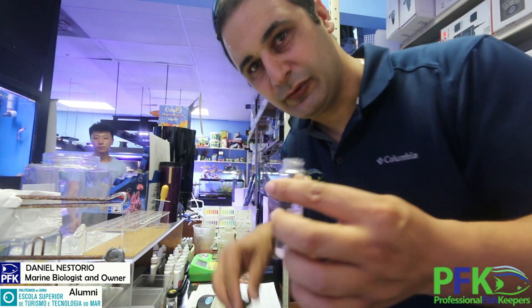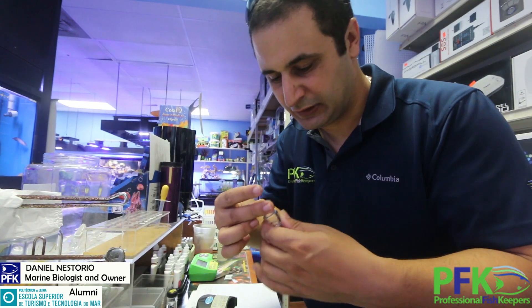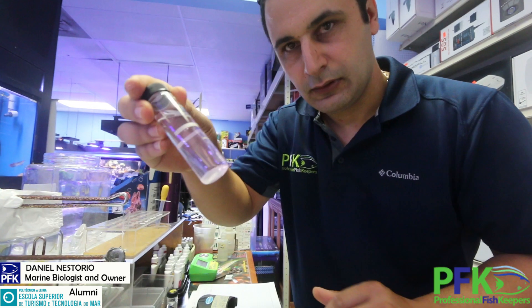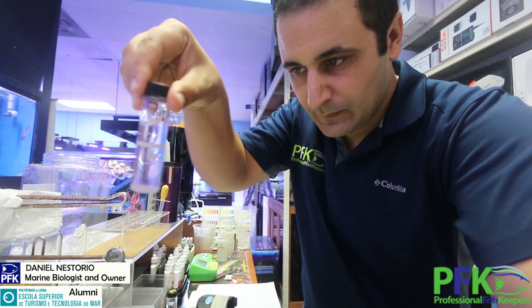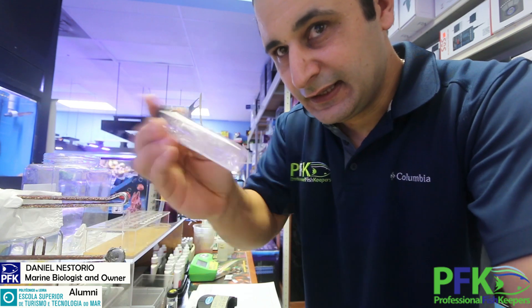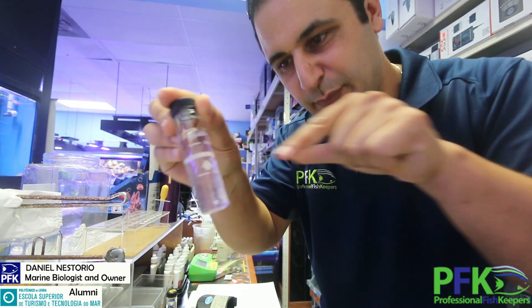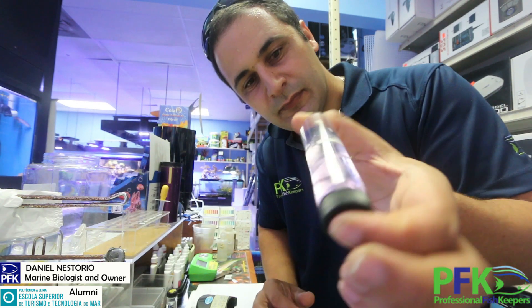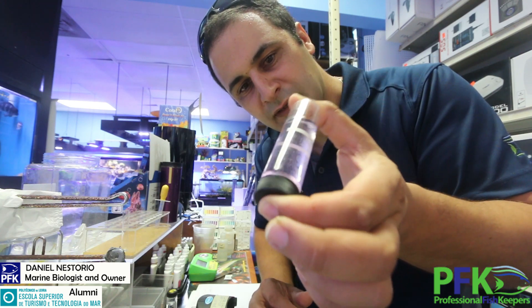Copper level is super important when you're treating for ich — it's going to turn pink. You want to shake it like this, not like this. I don't want bubbles, because bubbles will interfere with the light beam that goes through the tube, and that light beam is what gives you the readings.